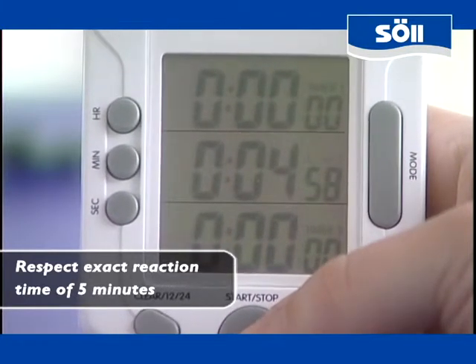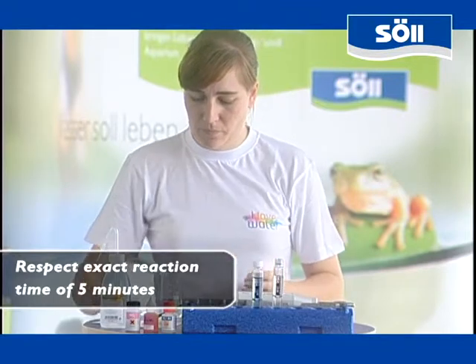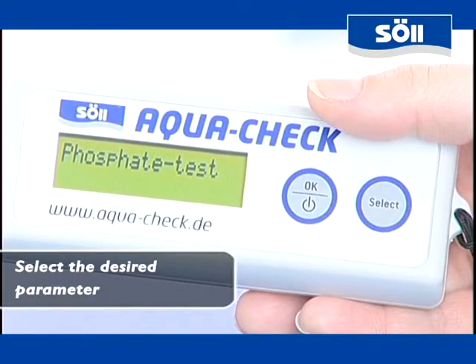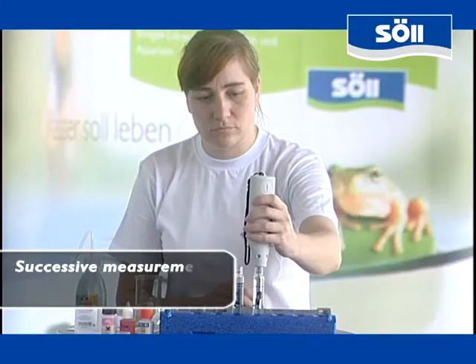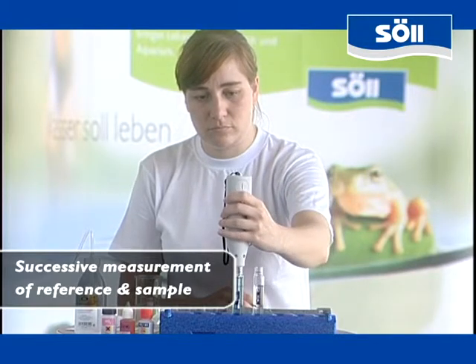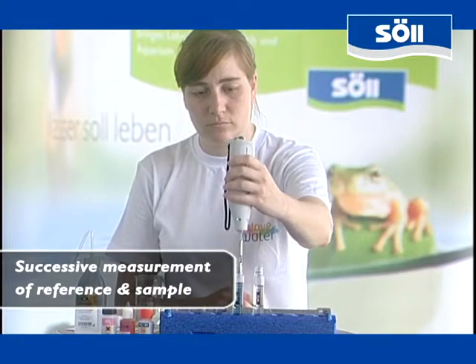Now you have to wait for 5 minutes for a complete chemical interaction. The AquaCheck set comprises a timer that allows you to meet the specific reaction rates. Choose the desired parameter from the device menu and confirm by pressing the OK key. First you measure the pure reference and then the light blue sample water. AquaCheck indicates the results immediately after the second measurement.